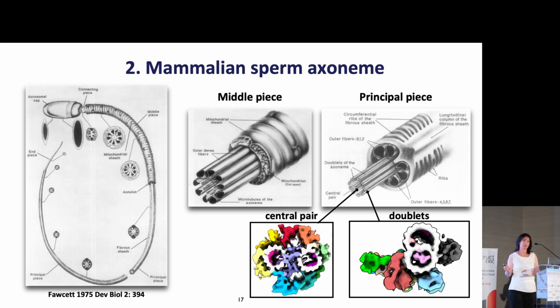But a problem that we ran into, and it's very often a question that I would get, is that it's very nice, very colorful pictures, but which protein is it? And what you can see is that the microtubules are actually full of proteins. And this is a question we were not able to answer with the tomography. And this is why we moved on.